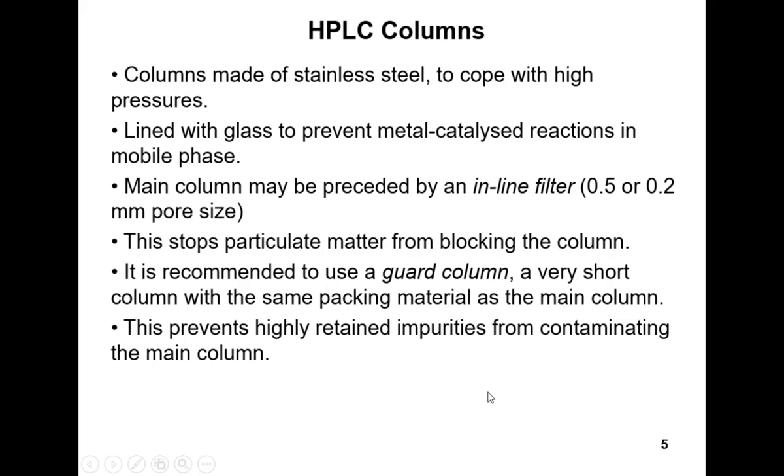The guard columns are usually just a few millimeters long. We haven't got one attached to that little column I passed around. So there's not going to be any separation occurring on the guard column. It's just there as a trap for any very sticky materials.